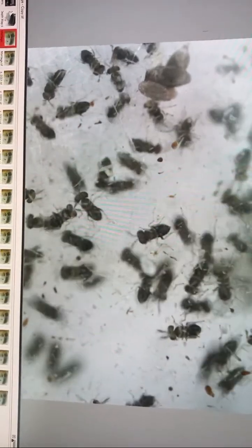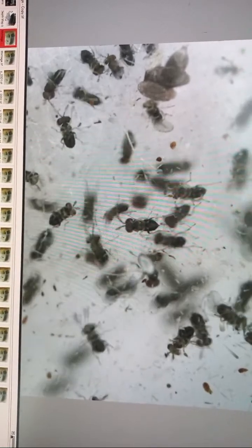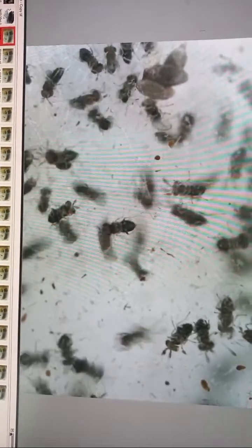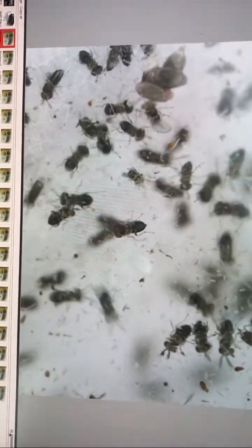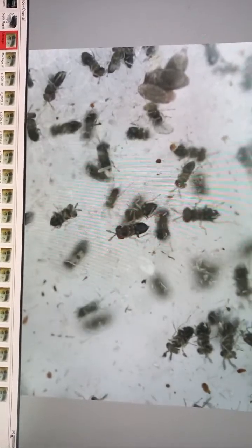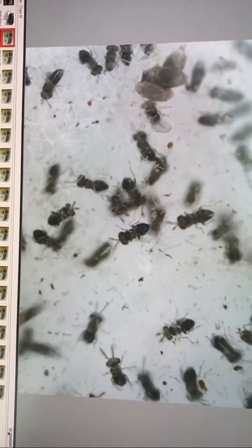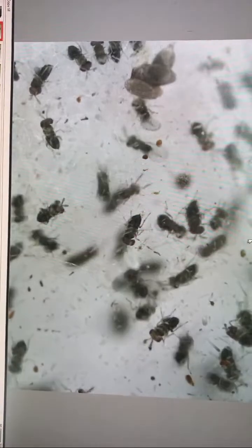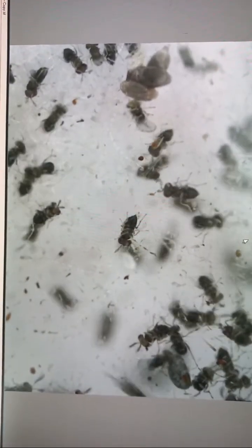This is direct stream from laboratory with insects which are just living now in late October. This is not a recorded model, this is online, on air. So you can write your questions, I can try to answer you. I cannot type because I keep telephone, smartphone in my hands, and I also try to manipulate with microscope.